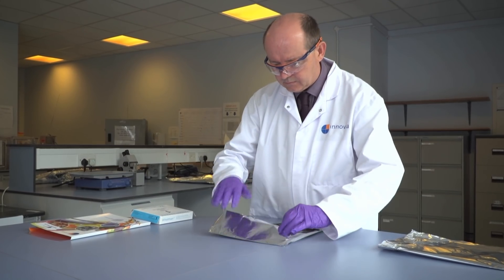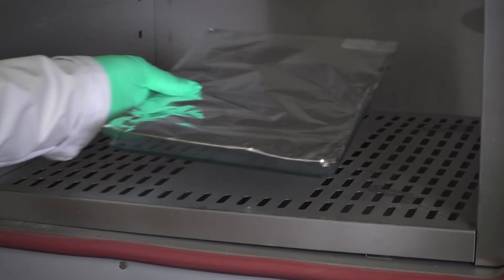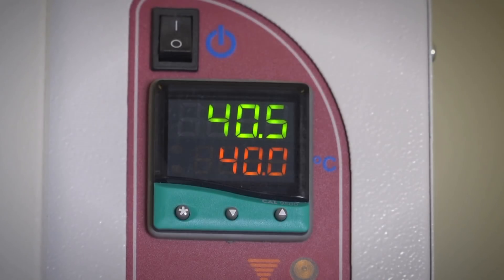This is then enclosed and taken to the oven to be incubated at 40 degrees for a set amount of time. This is an accelerated test and we can calculate back to the same length of time at room temperature.